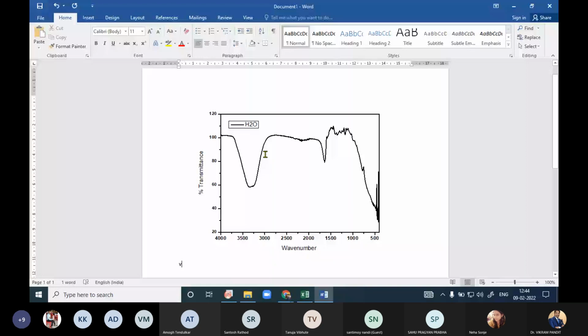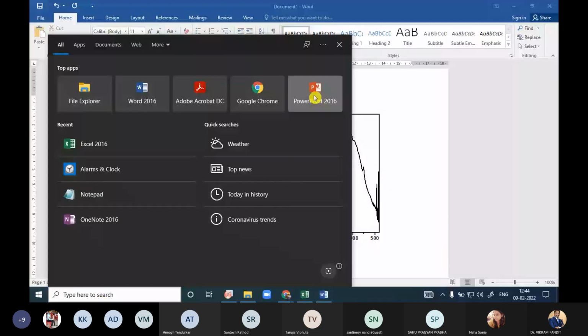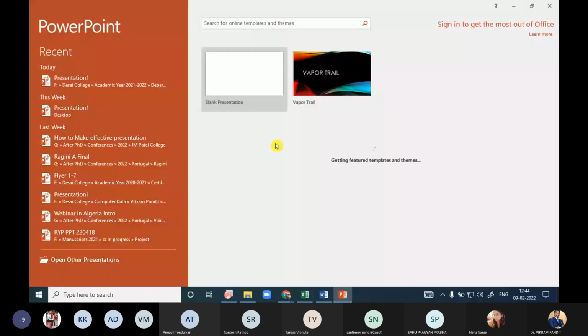But for getting published in a paper, you can use such type of images, okay? Or you can directly take a screenshot of any screen from Origin or from this Word. You can use this as your image in any type of paper. Few people, instead of taking this image into the Word, are taking it into the PowerPoint presentation.